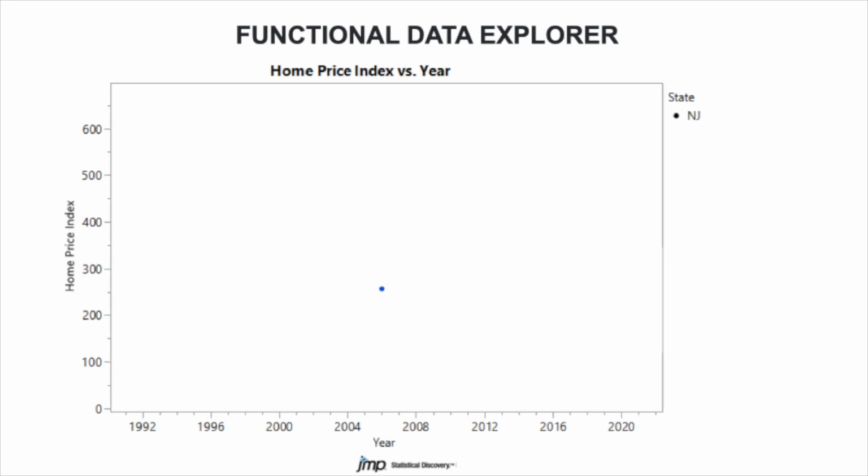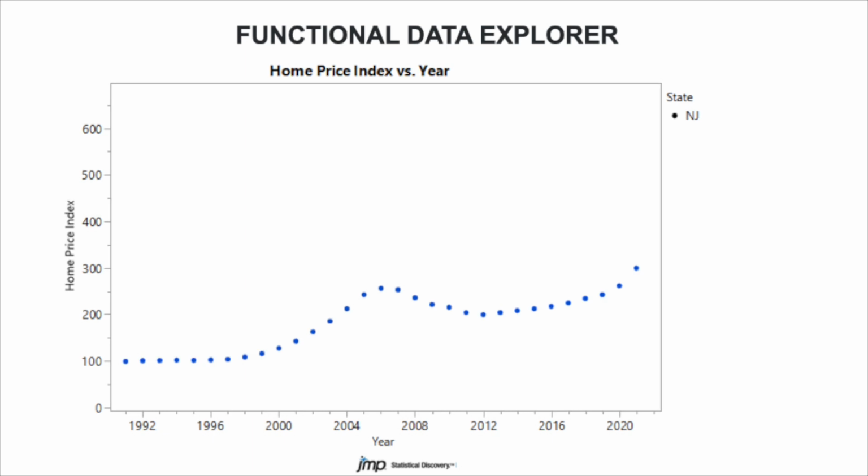And when we're doing functional data analysis, we're not really particularly interested in a single point or single measurement. We're not even really generally interested in a single collection of points that make up a single curve.